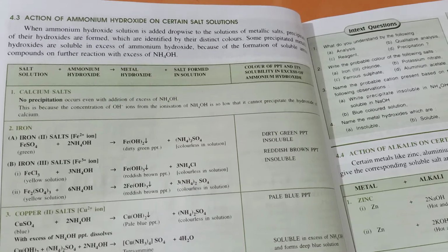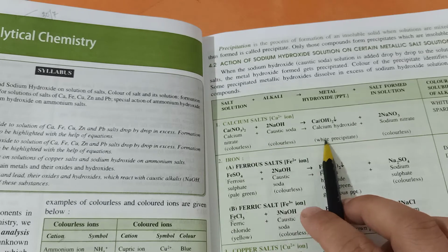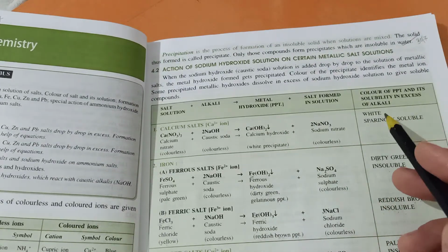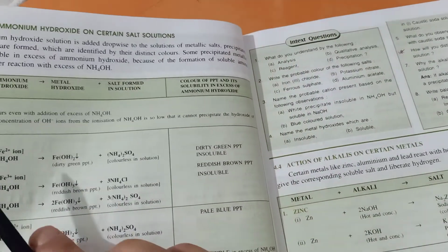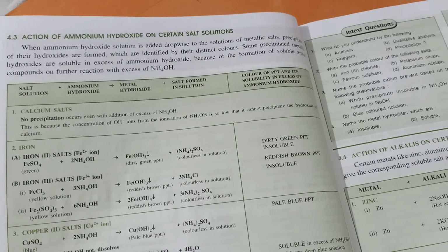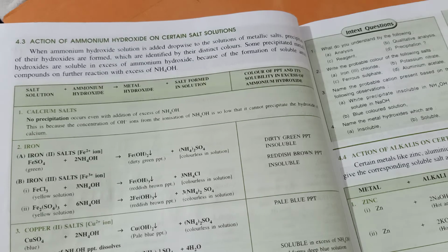Now, if you compare with sodium hydroxide, these calcium salts were forming a white precipitate of calcium hydroxide, which was sparingly soluble in excess amount of sodium hydroxide. But in case of ammonium hydroxide, these calcium salts do not form any precipitate. So this particular test can be one method by which we can distinguish sodium hydroxide from ammonium hydroxide.